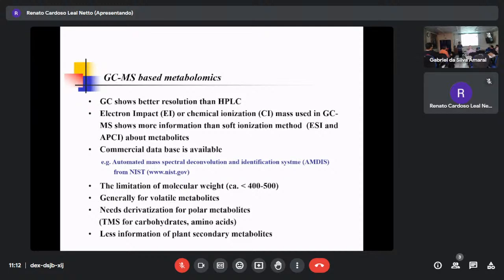But when you are doing most kinds of derivatization, yield is not 100%. TMS is very nice. After TMS, sugar TMS, all the TMS derivatives become volatile. Once they become volatile, you can detect them. So that's why GCMS is for volatile compounds.